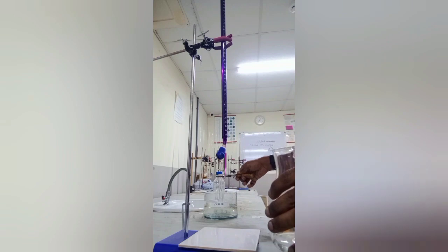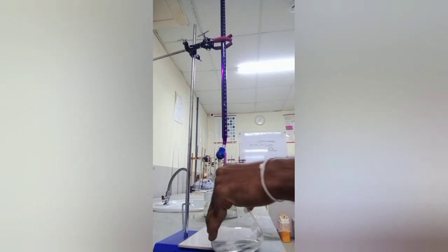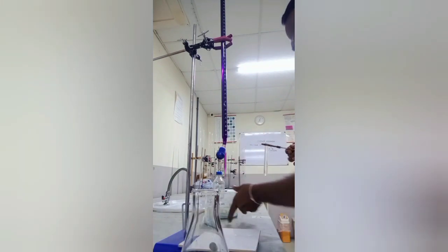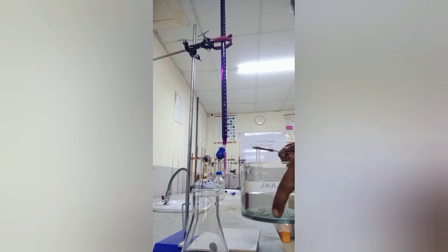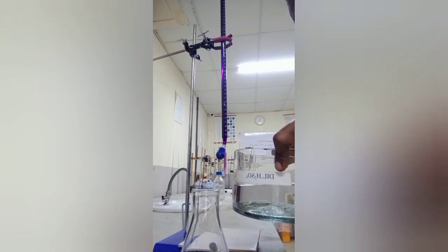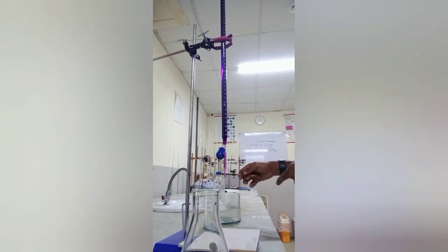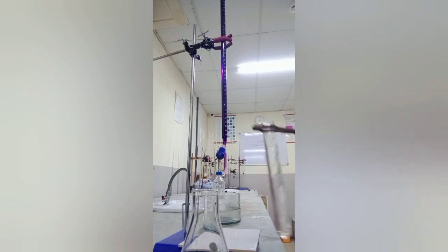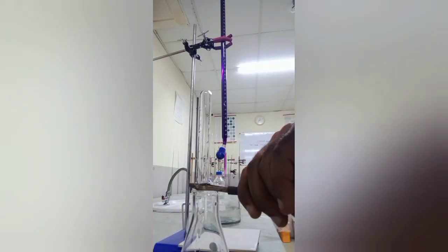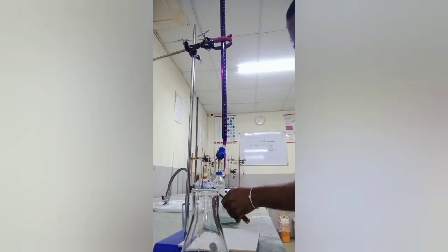Then you can take the dilute sulfuric acid condition. In the short procedure we have written the condition: before doing the titration you must add sulfuric acid. It will be mentioned as dilute sulfuric acid like this. If you ask the teacher also, the teacher can direct you. Dilute sulfuric acid, always use the test tube with the holder. You want to add 1 test tube full of dilute sulfuric acid before doing the titration. It is a must. This is the condition, because this reaction takes place in the acidic medium.